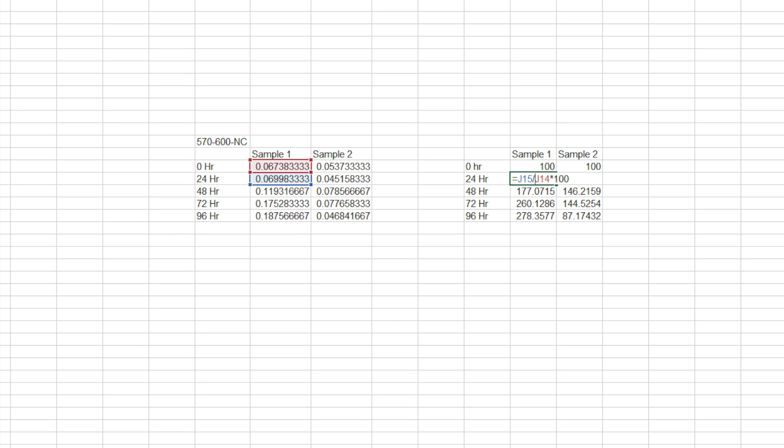So this is one of the more important steps where we're going to take your zero hour and set that to a hundred and so that's going to be a hundred percent of your growth and then you're going to track how that changes over time. And so as you can see highlighted at 24 for sample one, we're going to take the value of 24 hours, divide that by the value at zero hours, and multiply that by a hundred.